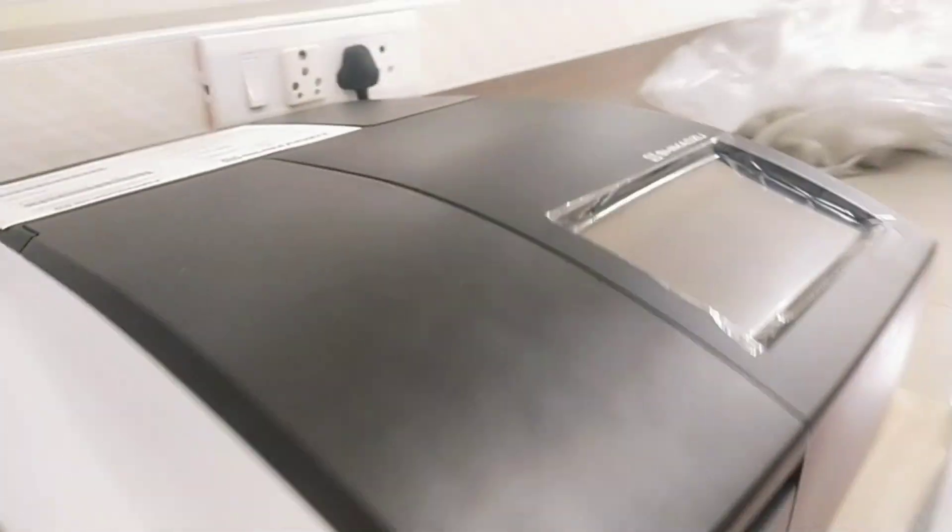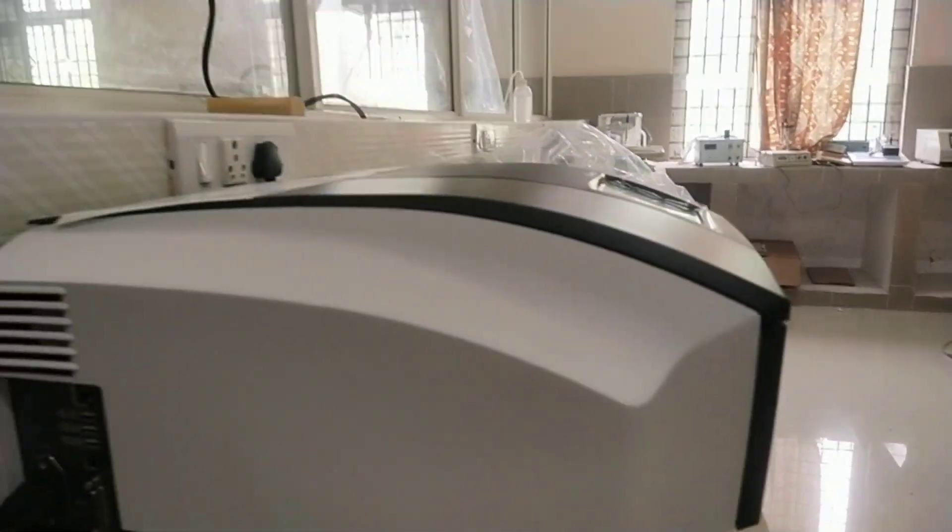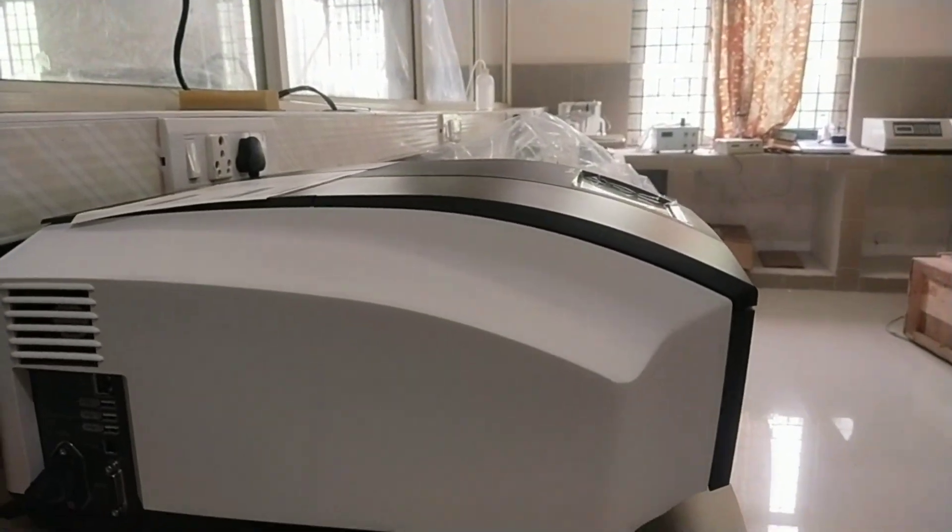It is a dual beam optical technology having a measurable wavelength range of 190 to 1100 nanometers. Spectral bandwidth better than 1 nanometer. Low stray light. Improved data processing with USB memory. Ultra fast scanning function.